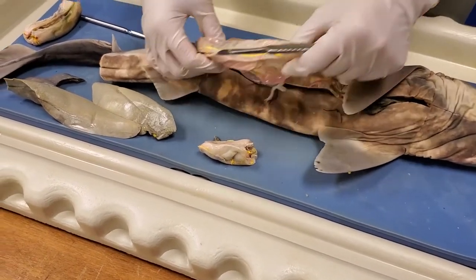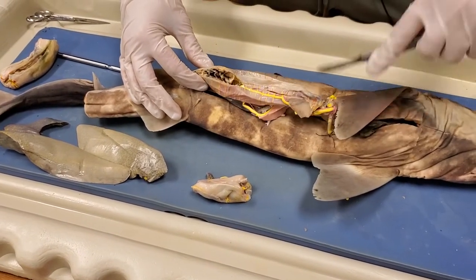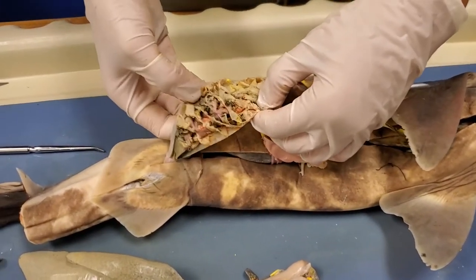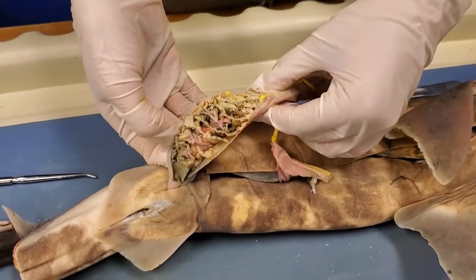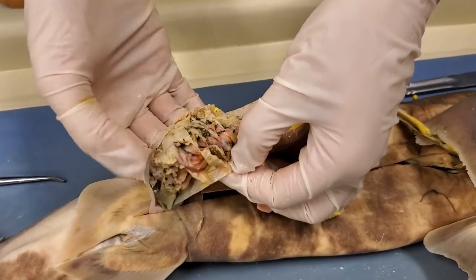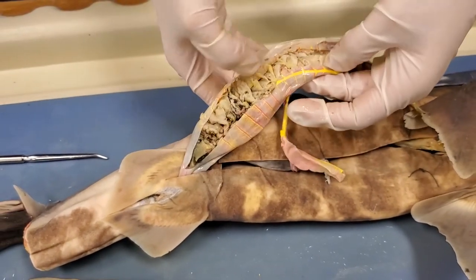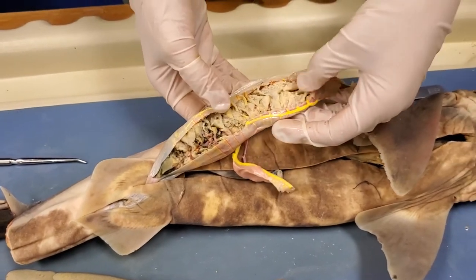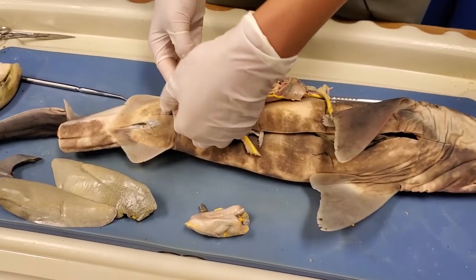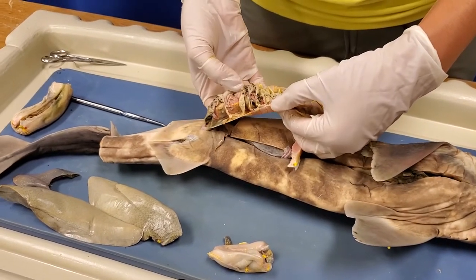This is the intestines — it's already kind of open, so I'll go ahead and open it up. You can see some partially digested food in there. Something really interesting about sharks' intestines is that near the end they have something called a spiral valve, which coils up really, really tightly. That's again to add surface area. Whereas you and I have an intestinal tract that spirals back and forth externally, in a shark the spiraling takes place internally — so it's not a really long intestine, it just spirals internally.